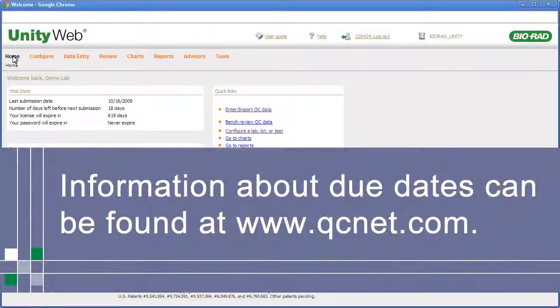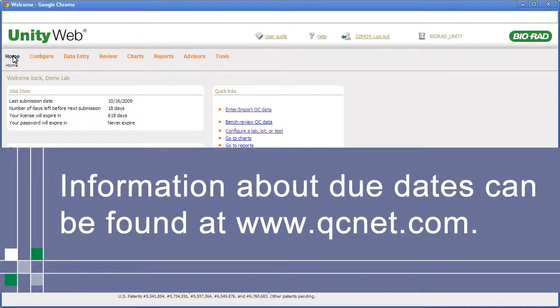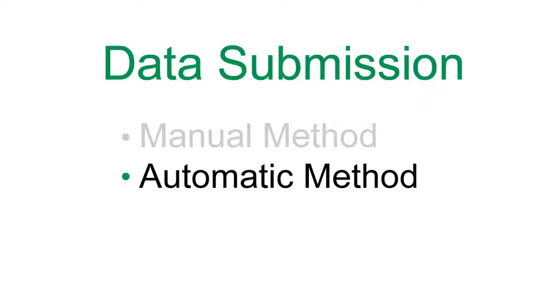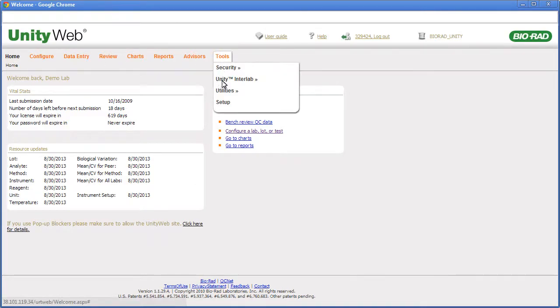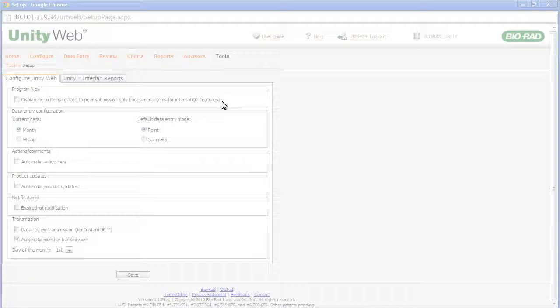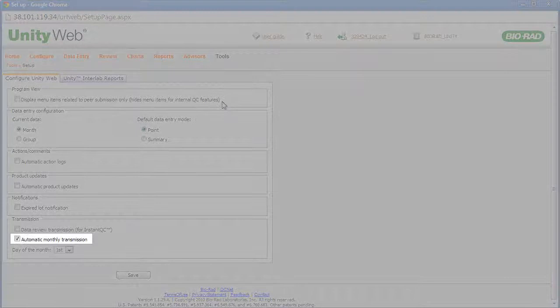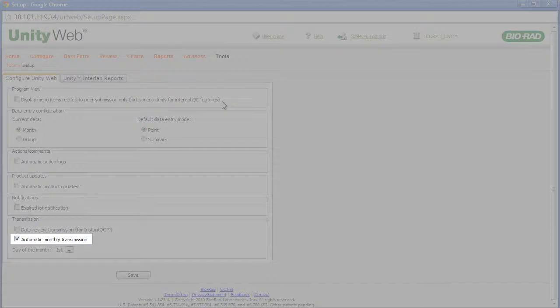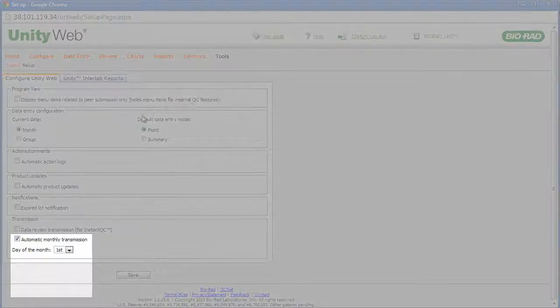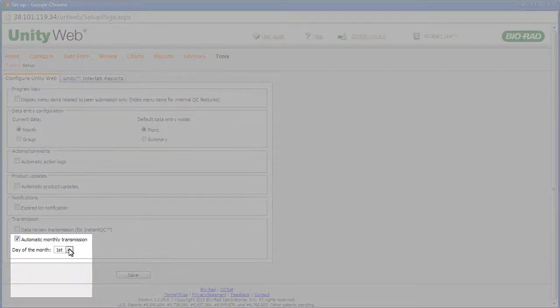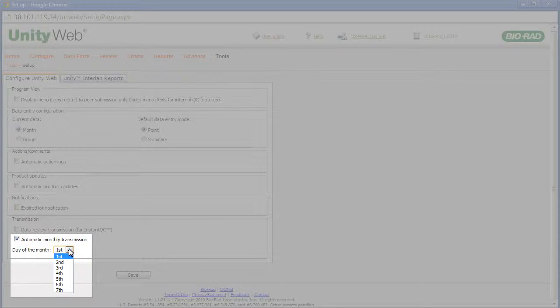Information about due dates can be found at www.qcnet.com. Unity Web 2.0 can automatically submit your data. To set this up, point to Tools and click Setup. Select automatic monthly transmission and choose the date you want the software to submit the data. Note that your data must be entered or imported into the software prior to the date you select.